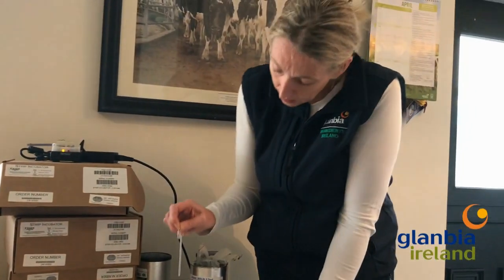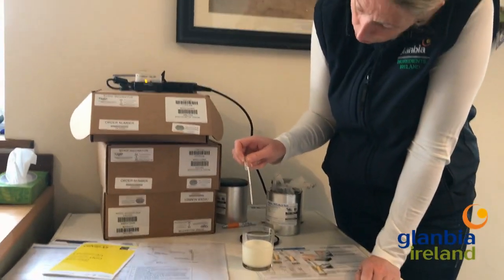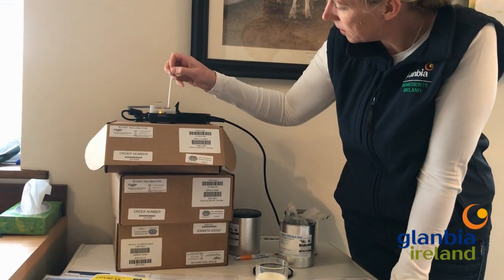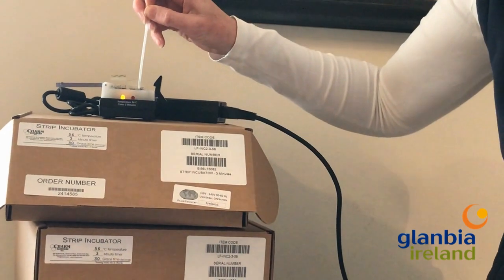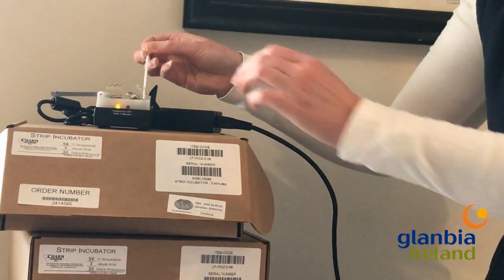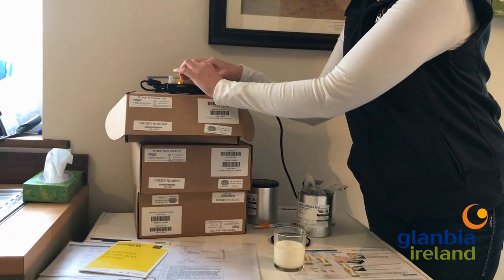Then you take a pipette and sample the milk just like that. Fill it up to the line — no more or less. Push out the milk into the little well. There's a little white line on the incubator that makes it easy for you to see where to put the milk into. I'll show you that in a second.